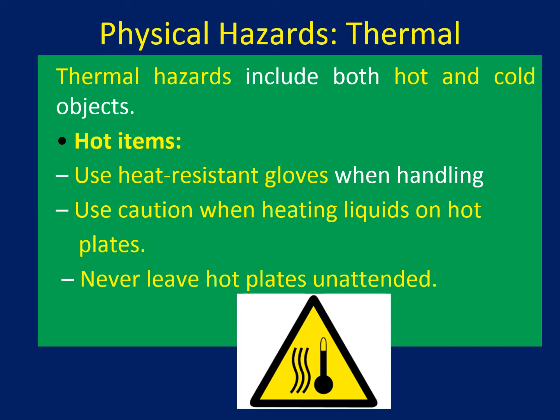So when you are handling hot items, use heat-resistant gloves, and when you are heating, take precautions, and never leave a hot plate unattended.